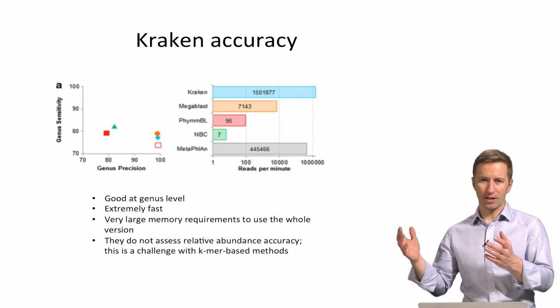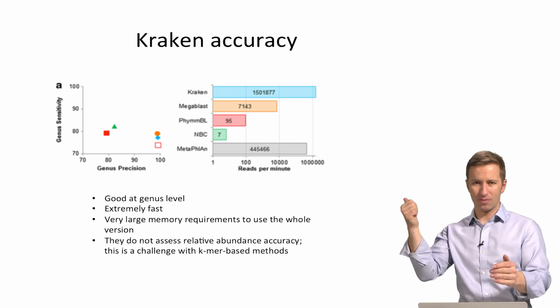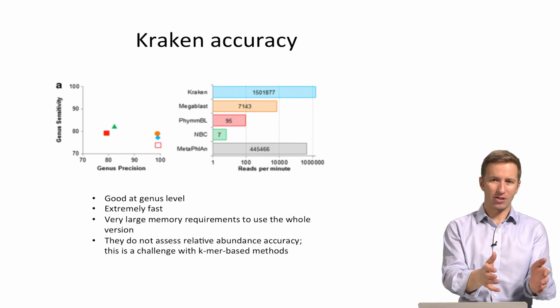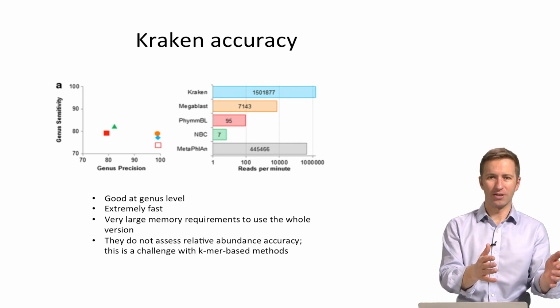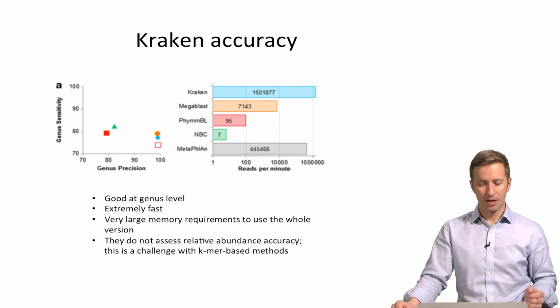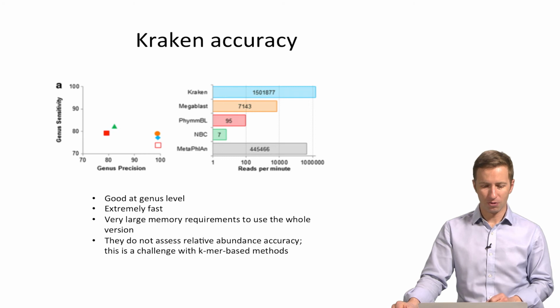So if you see, here's an input sequence, you take every sequential k-mer and match it to the unique markers. If 30% match one bug and 35% match another bug, and the other 35% are matching a whole bunch of other random bugs, should you call the one with a plurality or should you toss it? And that voting approach hasn't really been explored yet. Definitely an area of future work.